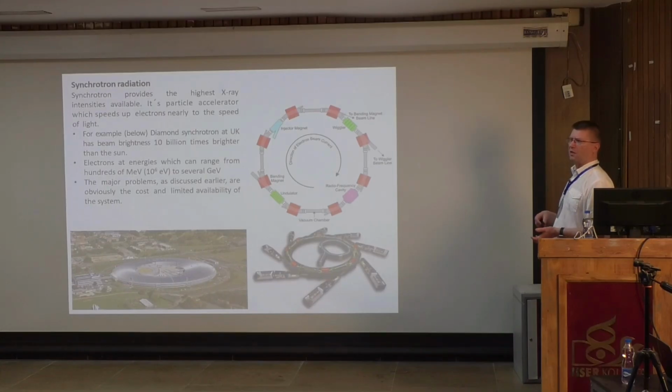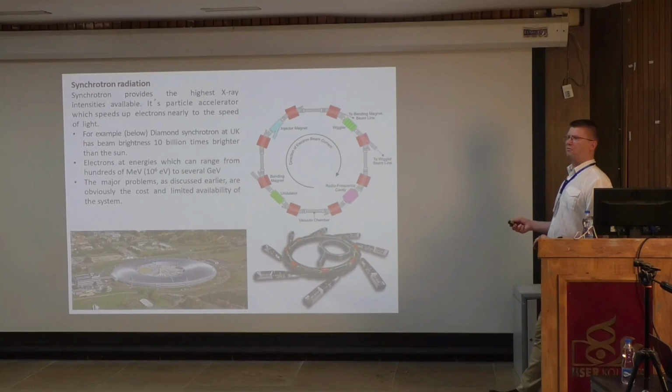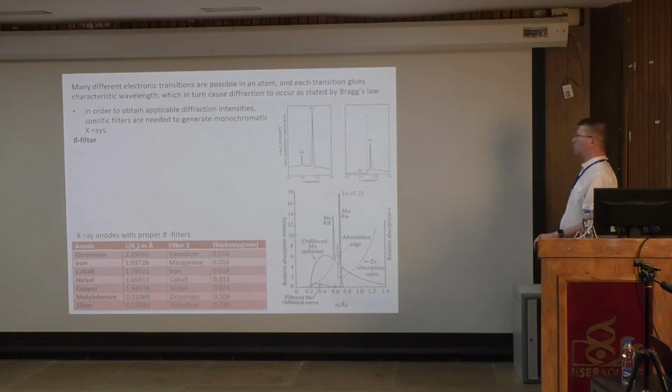Sometimes you have to protect them. They are very sensitive to air. You have to keep them in dry ice or liquid nitrogen and so on. Having this on an airplane will be really complicated. So the use of synchrotrons is not very useful, let's call it like this. But protein structures are exclusively done by synchrotrons.